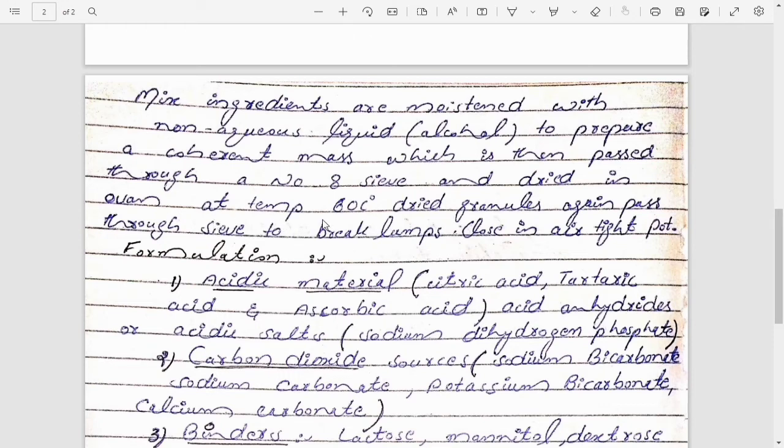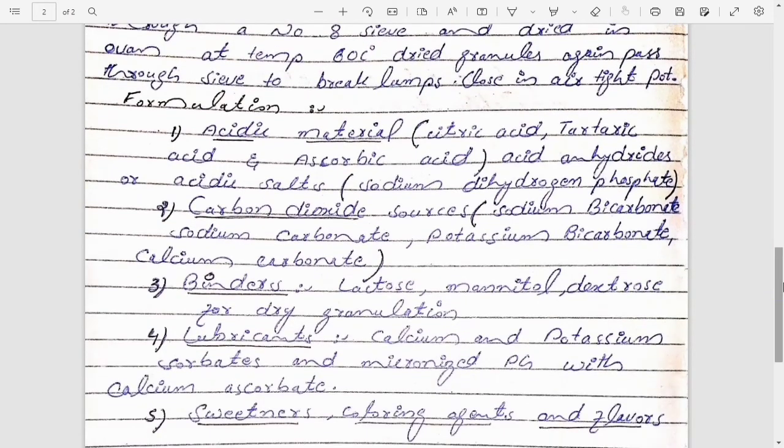in oven at temperature 60 degrees centigrade. After drying, this granule will be again forced through a sieve to break the lumps. Sometimes when we dry the granules in oven, some granules come closer to each other and form lumps. So to break those lumps we have to pass again these granules from the sieve, and after passing again from the sieve we will close these granules in airtight container.